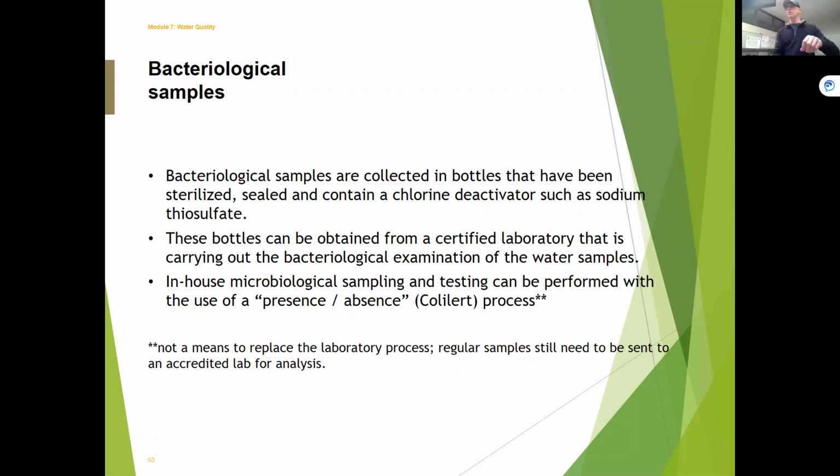It's made to open, put the sample in, and turn it. Don't rinse the bottle ever. Don't rinse it. Don't put your fingers onto the threads of that bottle.